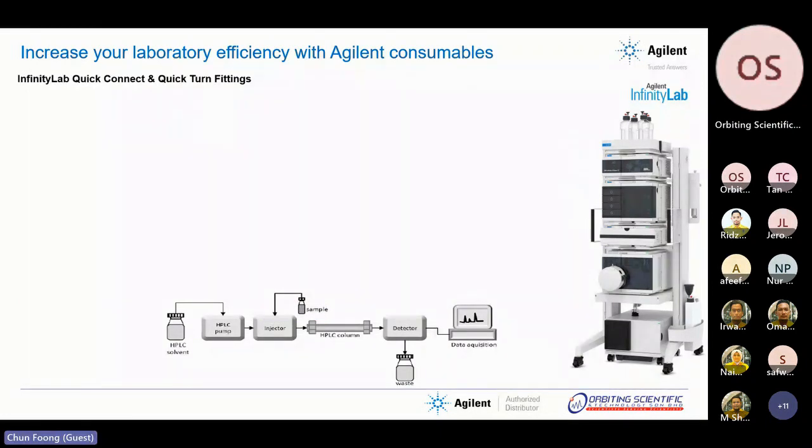So after the sample part, we come to the connections. It is especially important at the column connections. For those who have experience in changing the column, maybe you can recall, because from field visits we saw customers doing this.